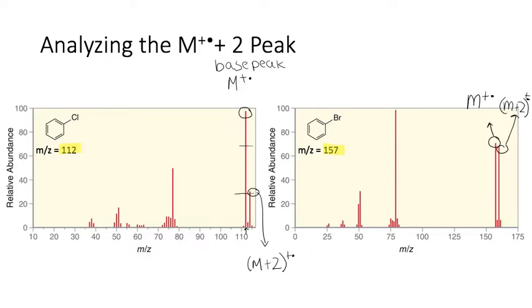Doesn't fit, so I'm squishing it in there. Also take a look, the base peak in this case is not the most abundant, or the radical cation peak is not the most abundant in this case.